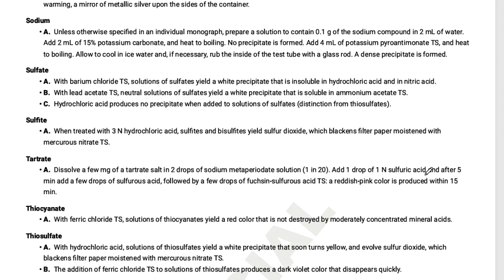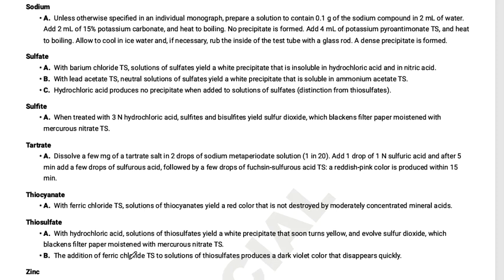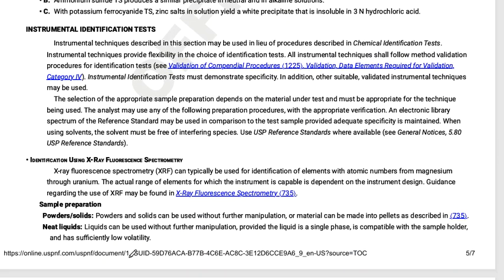That's fine. I can order all of these reagents, by the way, through a chemical supplier. They can already be pre-made. I don't really have to make them myself. I'm just going to pay a little bit more for those because they are standardized, legit USP reagent type of stuff. And if I want to make them myself, I can, because there are recipes that go along with this. All right, but either way, there's the chemical identification test.